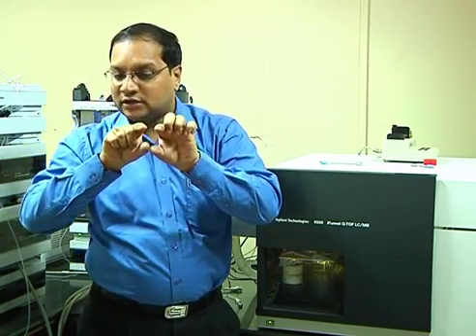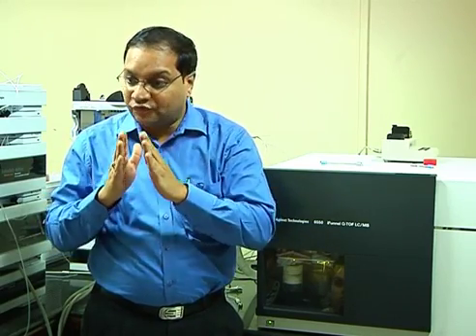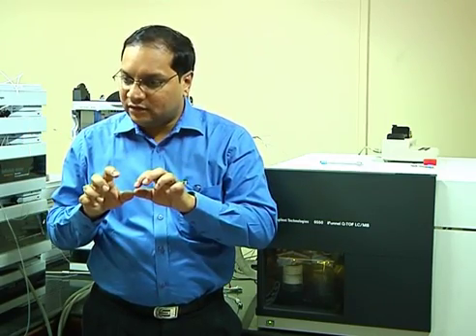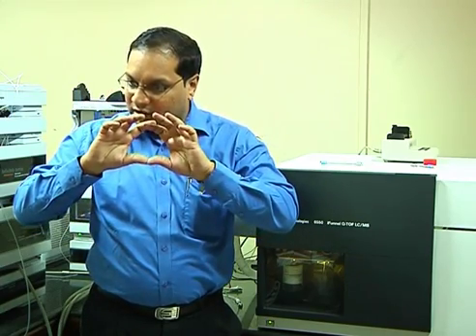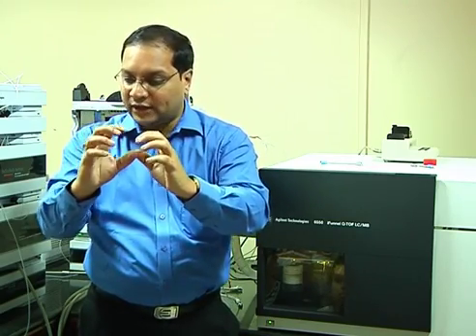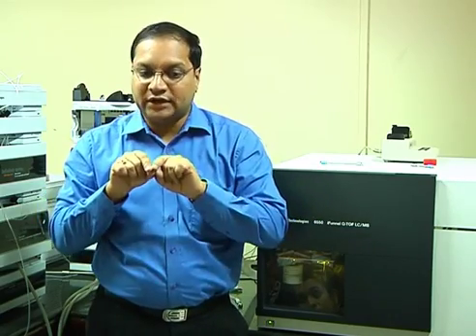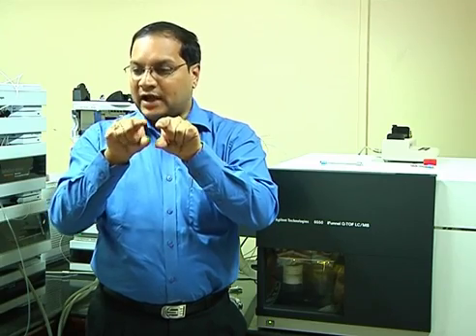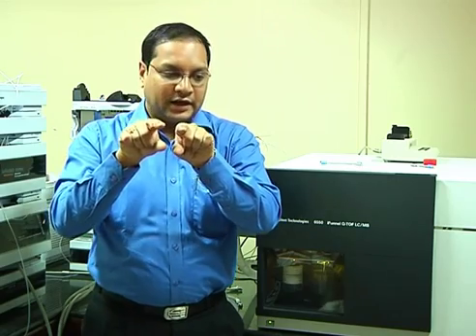Okay. So what is the logic? It is also called as mass filter. Why? Because it has the ability to filter mass. If you say look for mass of 500, it will filter everything away and only allow 500 to get inside the quadrupole and travel through that. Travel through 4 rods. How it does that? These 4 rods are at different electronic states like RF and DC voltage. For example, this rod and this rod, alternate rods are in RF mode.